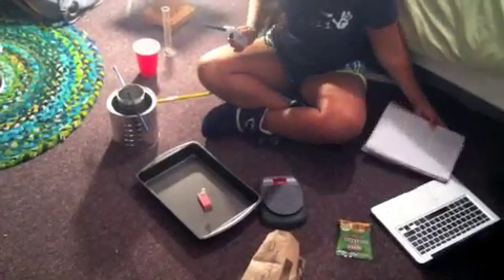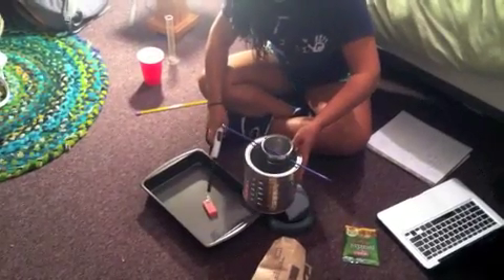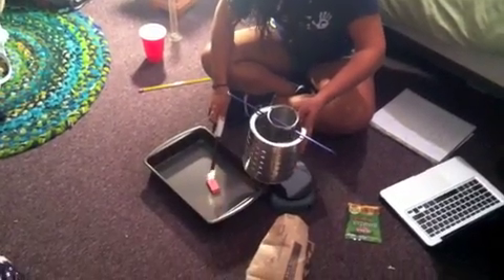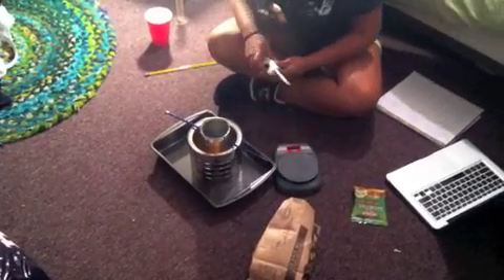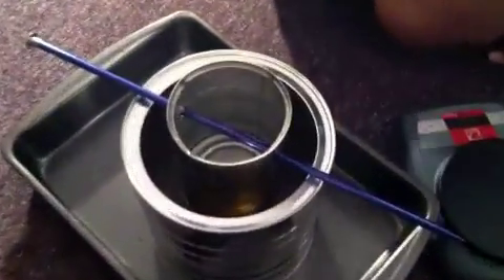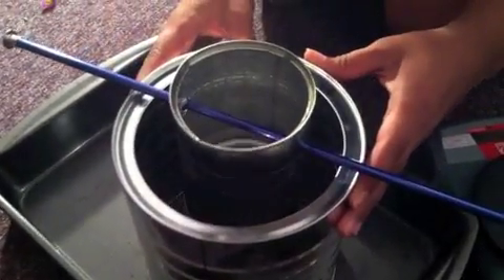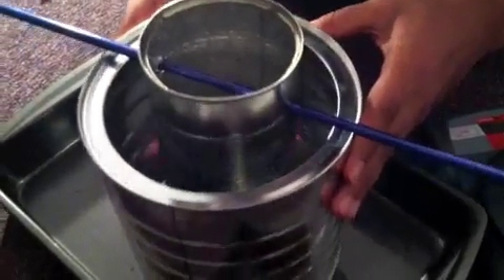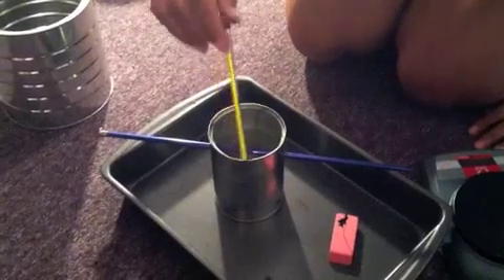Okay, here we go — placing the can over the flame, making sure it's centered. The flame is dying now — it's still going a little — and now it's out. I'm going to move this over and remove the can to the safe surface so we can measure the temperature afterwards.